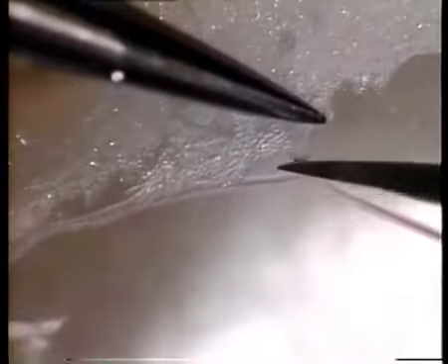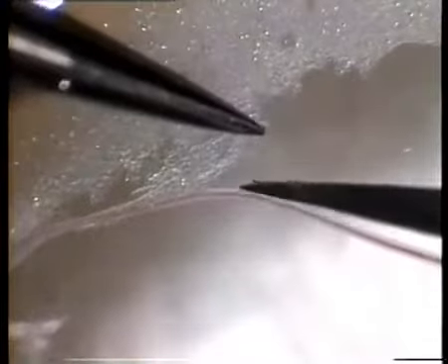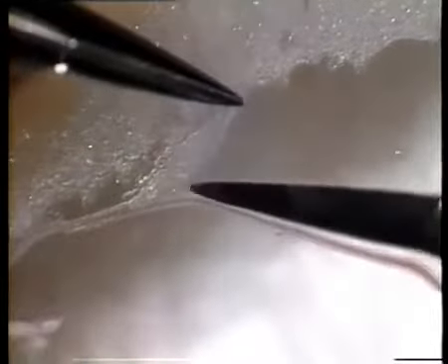Now we are down to the third and fourth branches that run close to and send smaller branches into the gut wall. The fat and the connective tissue come off easily here because of the stretch of the bowel.